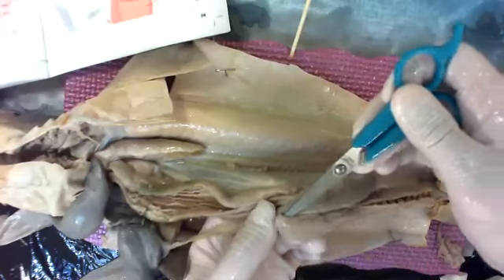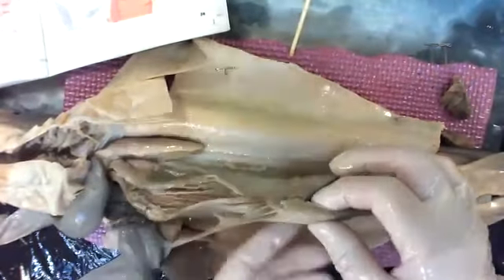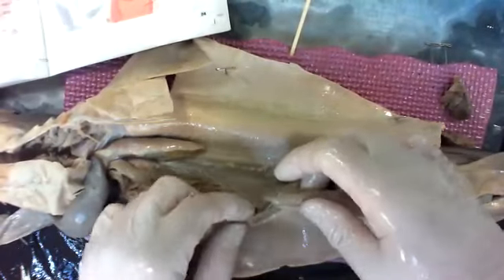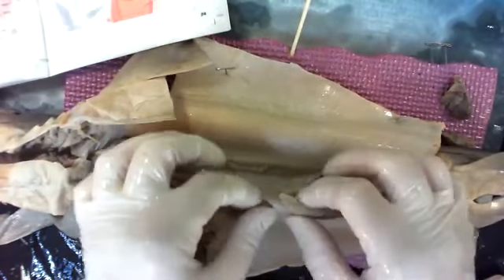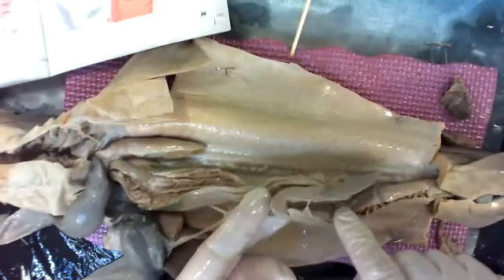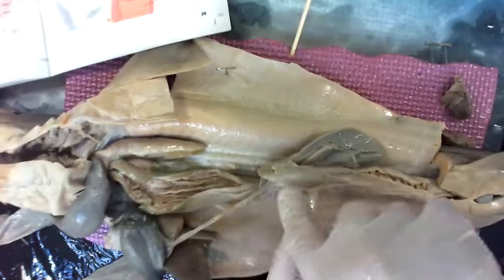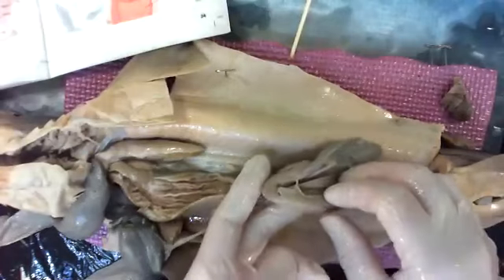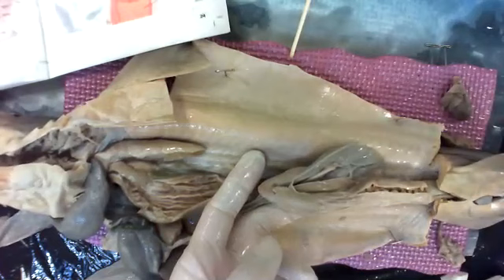There. It's the pancreas. So the pancreas is really important for a couple of reasons. It makes chemicals that help you digest food, and that's why it's right here by the small intestine. This cord that comes over, the bile duct, connects up to the same structure that the pancreas connects to, and they both push chemicals into the intestine to digest food. Bile digests fat. The pancreas releases enzymes that digest proteins and sugars. So now you have all three major nutrients covered.